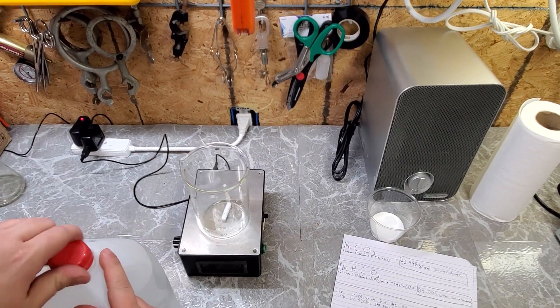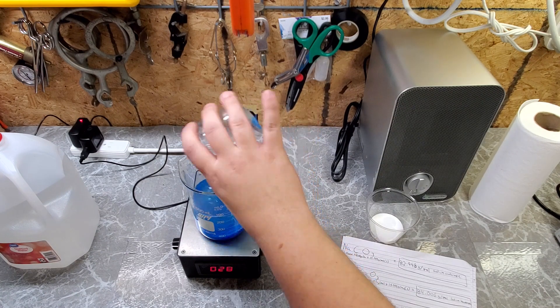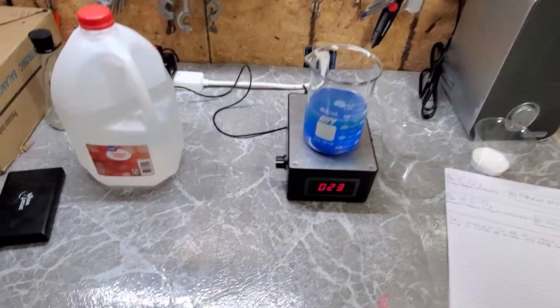This is the down and dirty way to make copper chloride from hardware store chemicals. Copper chloride can be used at home for PCB etching, crystal growing, crystal gardens, and sometimes as a wood preservative. I mainly wanted to make some because I think it looks awesome.